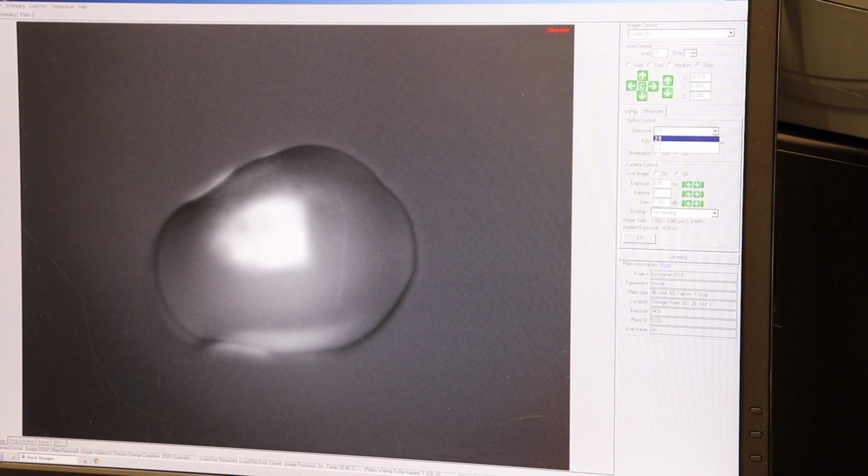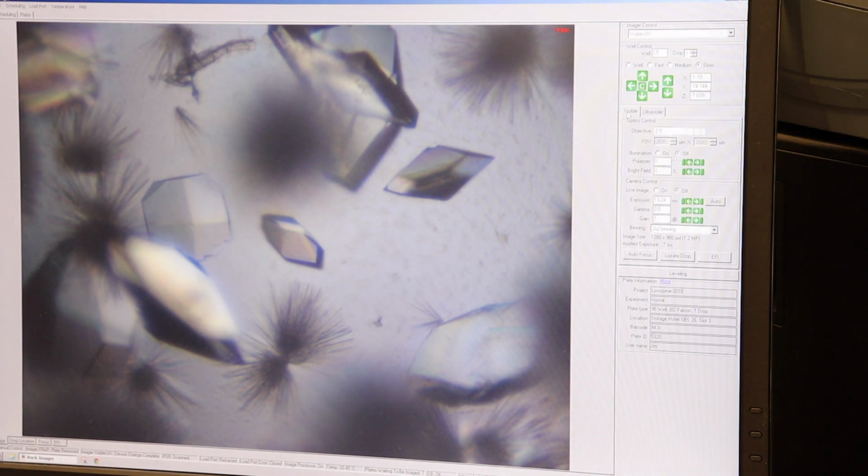So the best way to do this, if you want to look at a picture of something at 7 in UV, is to go to visible, set the zoom to 7, center what you want to look at, and get it in focus as good as you can. The XYZ coordinates should transfer over to the UV imaging. You may have to refocus it a little bit because they are 2 different cameras.